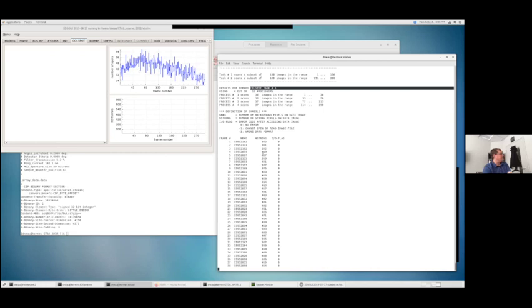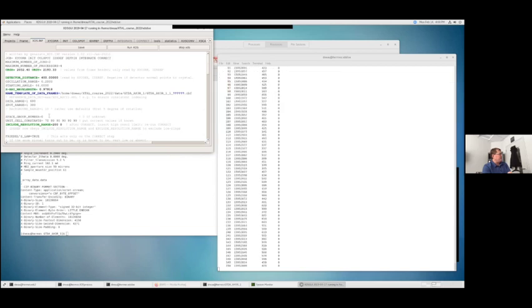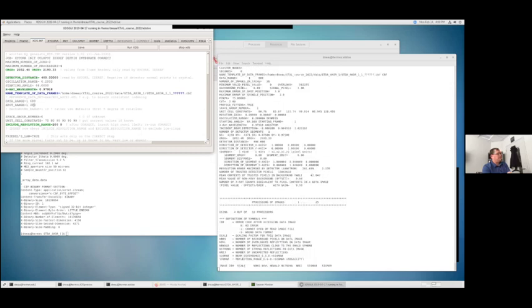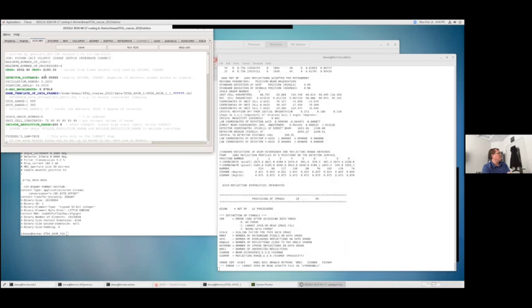Colspot is the first step that takes a little bit of time. Again, it's looking at the images for the spot range, and on all those images, it's doing 300. So if you have a computer that doesn't have a lot of processing power, rather than looking at half the data set, you might want to look at a quarter of the data set, or the first 20 degrees of the data set, for instance. Okay.